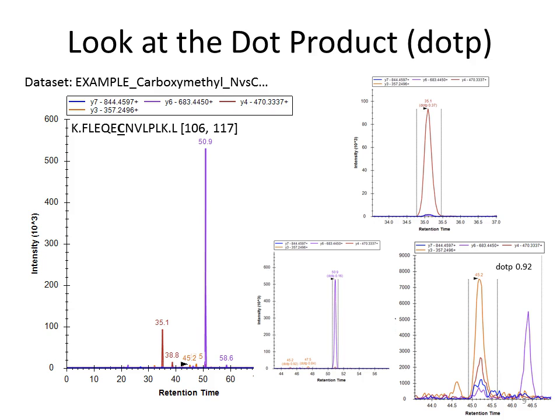And then the one that Skyline actually picked, Brandon would be so proud. It's very small. The intensity is very low compared to the others, but when you zoom in, all 4 transitions perfectly coelute. They may not look that great, but they're all under the same general peak area, and there's signal for each and every one of them. And we saw that in the Spectral Library. That's why we pick these transitions. So that's a very good confirming bit of evidence. And the dot product is 0.92. So we have high confidence that all of those product ions are coming from that peptide, and that's the peak that represents the peptide eluting. I see looks of concern. Are there questions?